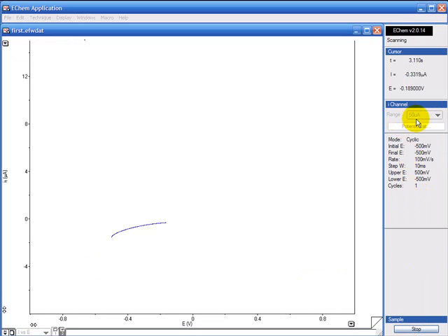At this new reduced range you can see the shape of the cyclic voltammogram is much better. I can see some shape.